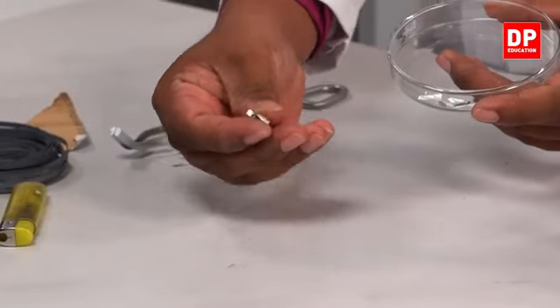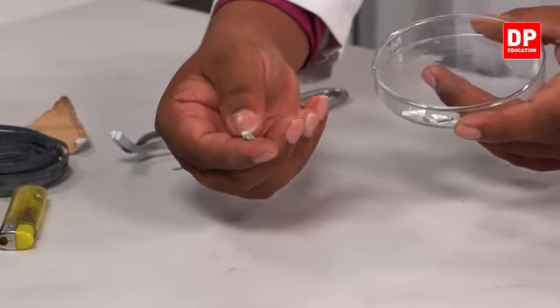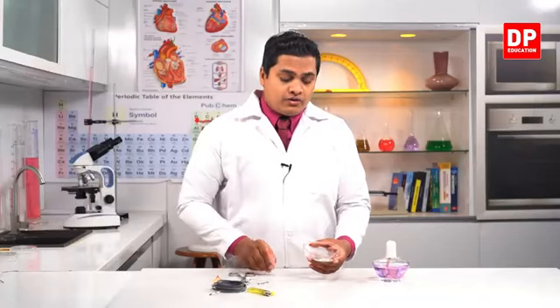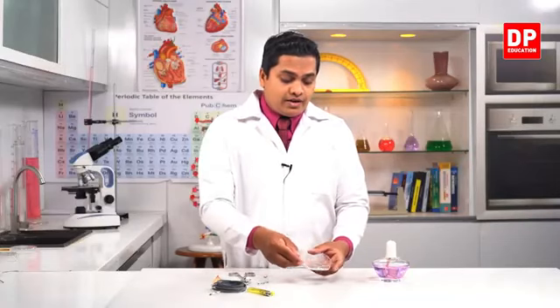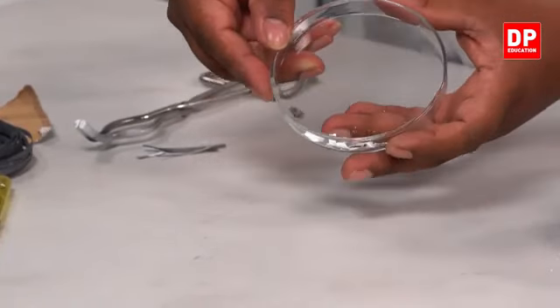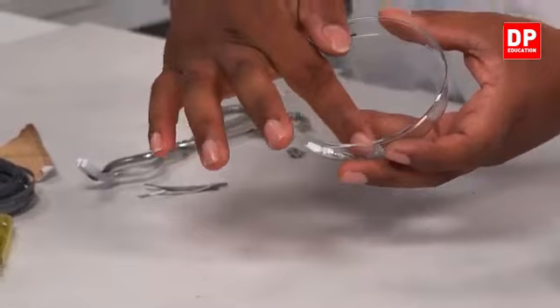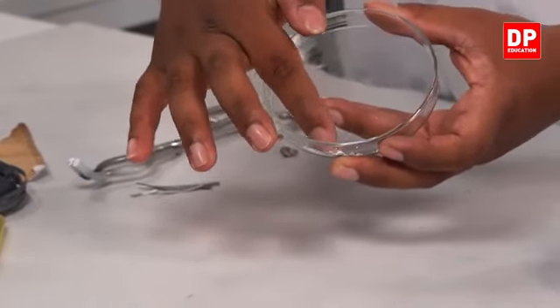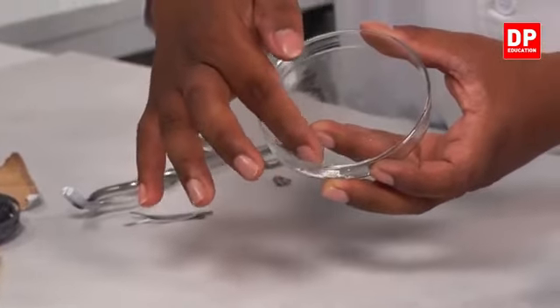It's not like a powder, you can observe it clearly, it's hard, right? Now this is the residue or the remainder after the burning process of magnesium. See, it's getting into a powder.